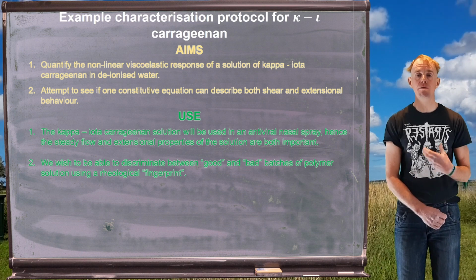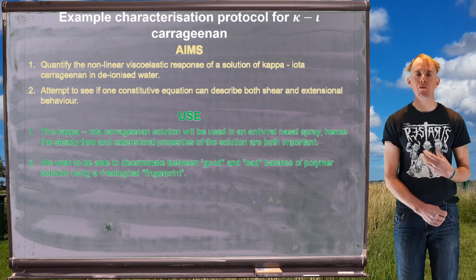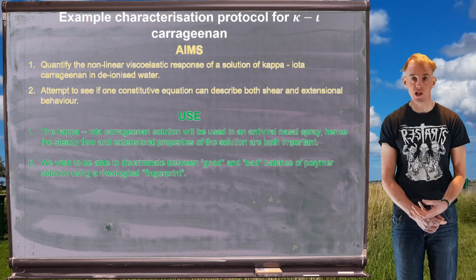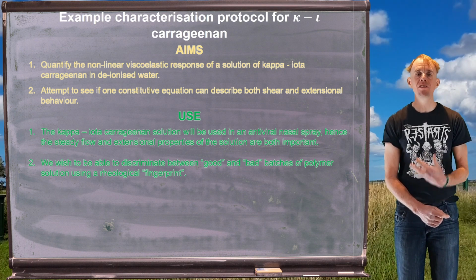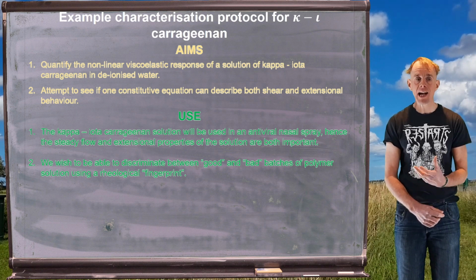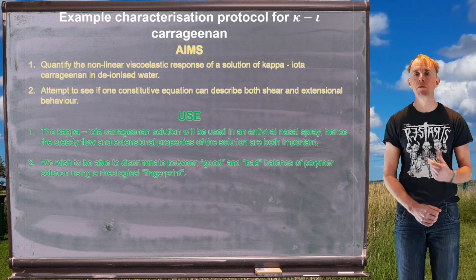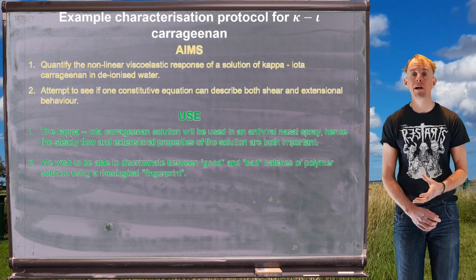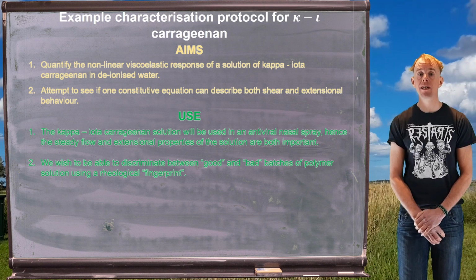And so if the rheology of the material changes, the way in which the material jets will change, the way in which it will flow inside the nozzle will change, which means that we won't necessarily have the level of repeatability that we desire. However, getting a good rheological fingerprint of our material will give us great insight into whether or not a new batch of material is actually going to work in the intended manner.